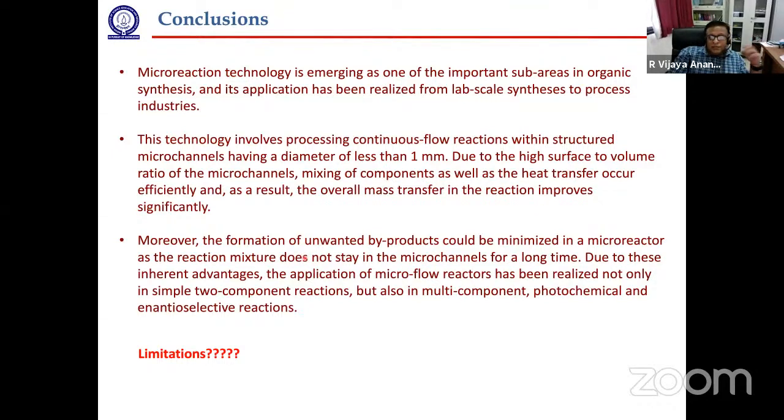And the formation of unwanted byproducts can be minimized in the microreactor because the reaction mixture does not stay in the microchannels for a long time. This is another important point I already told you. Due to these inherent advantages, the application of microreactors has been realized not only in simple reactions but also in multi-component, photochemical and enantioselective reactions.